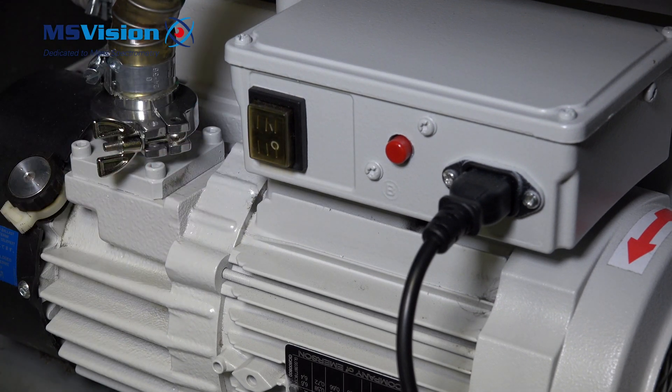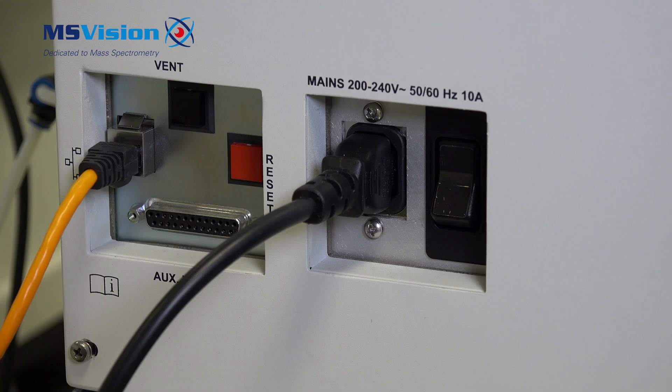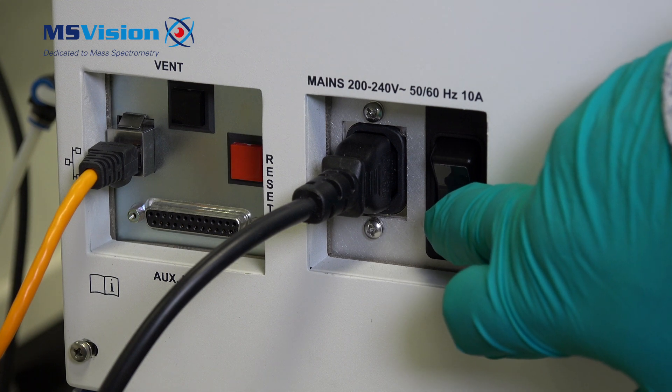Flick the power switch to off. Finally, turn off the main power to the system.